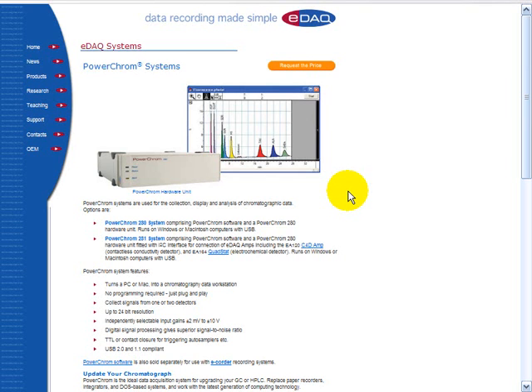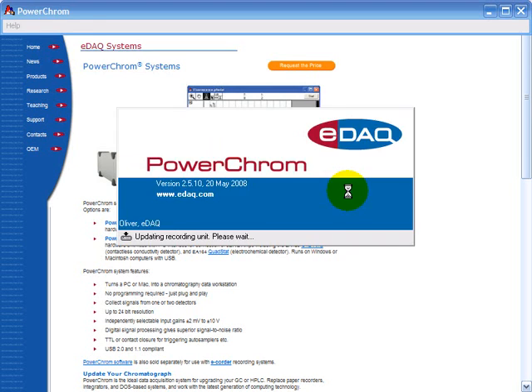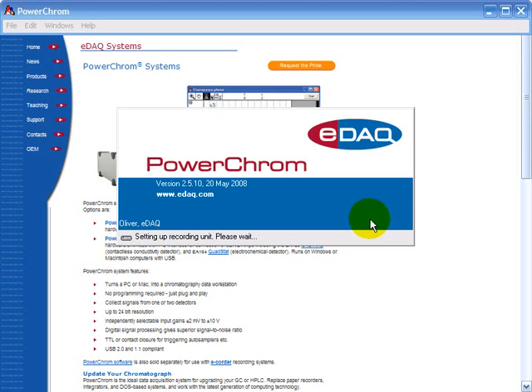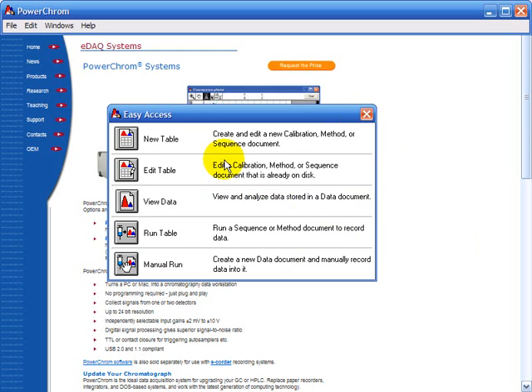This screencast shows a procedure for recording data in PowerChrome. You start by opening up the PowerChrome software and get this easy access window.